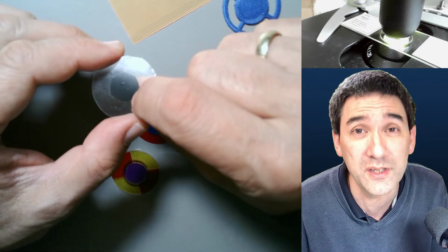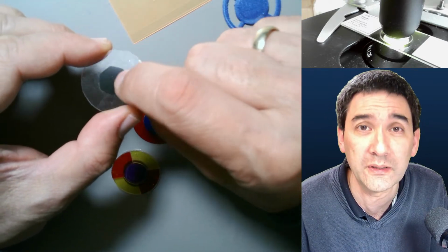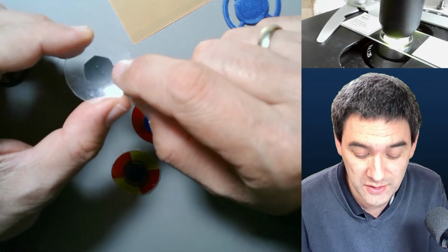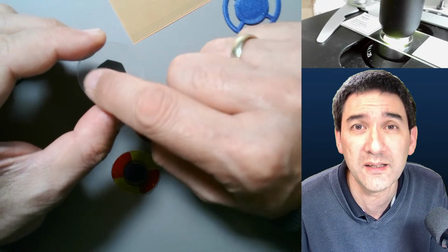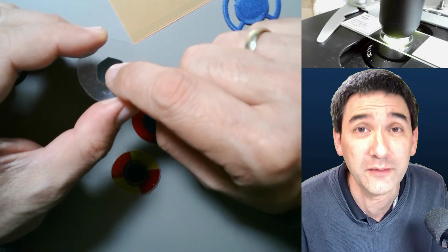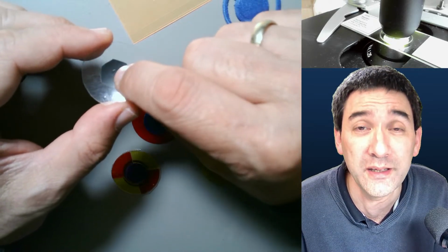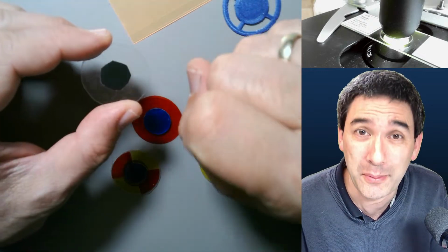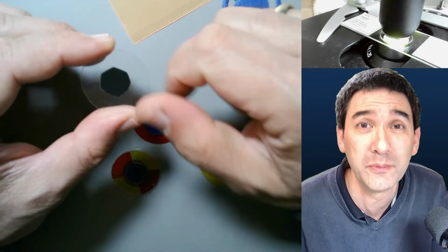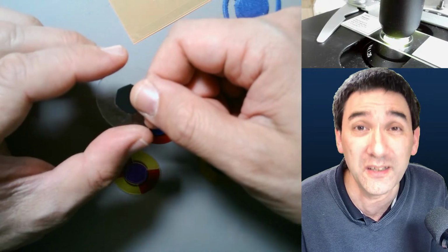I've tried this once because I really had problems blocking out the light. But you've got to be careful with that, right? Because if the aluminum tin can is shiny, it will block the light very effectively, but it's also going to reflect the light back directly into the lamp. It acts like a mirror.